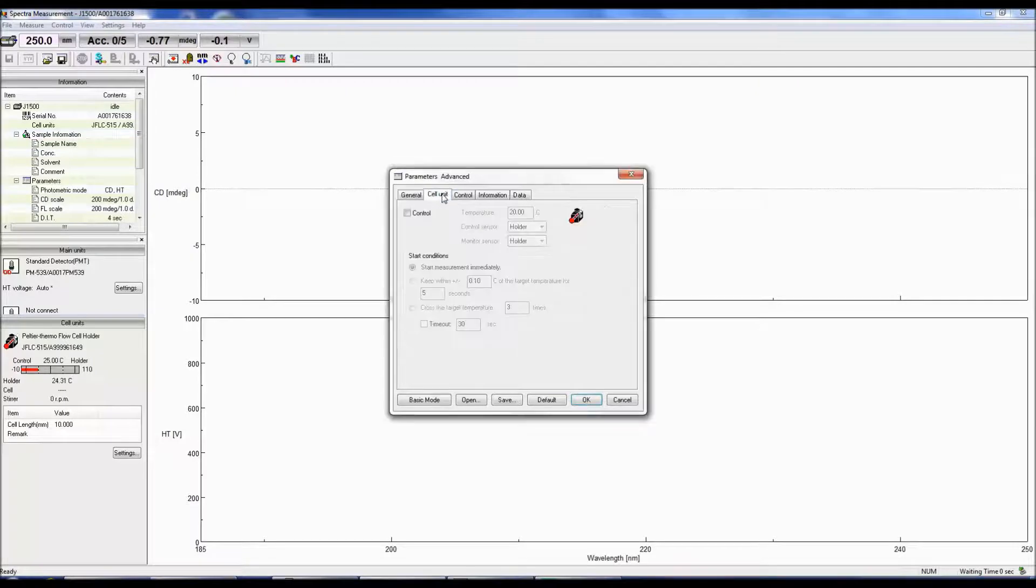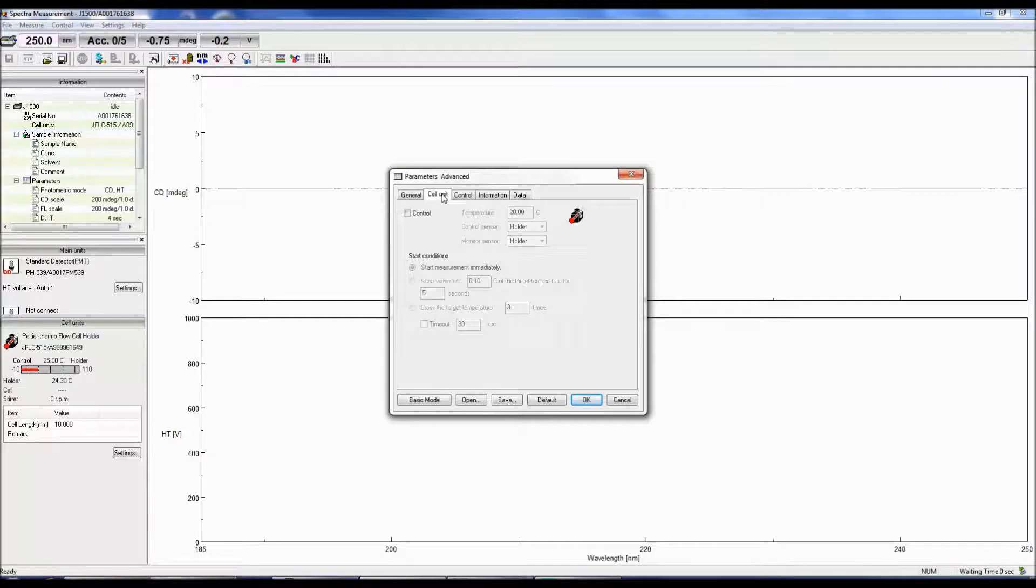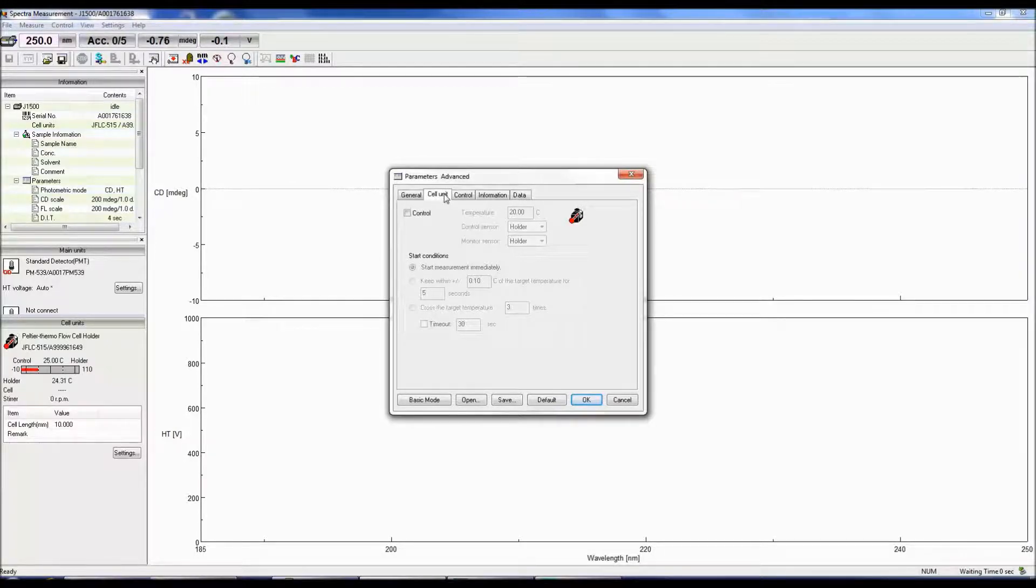The cell unit tab will be displayed if the cell holder is a Peltier unit. This parameter tab will be discussed in the setting up parameters for temperature studies videos.